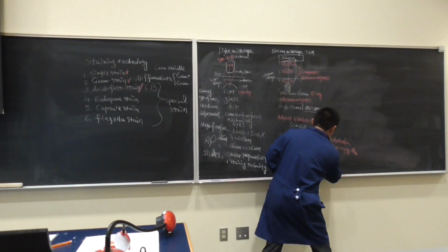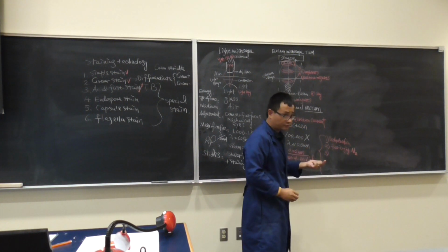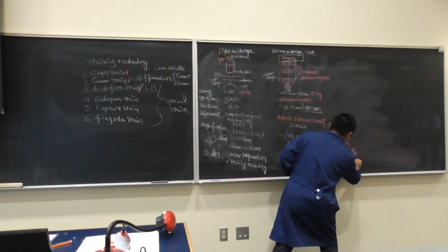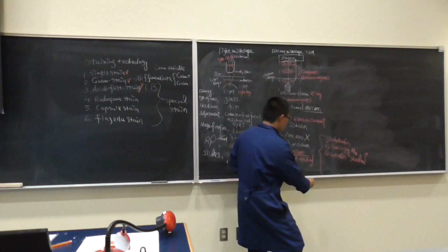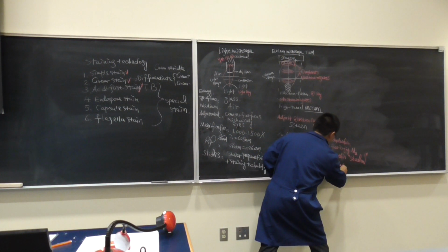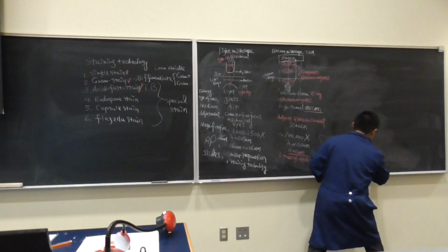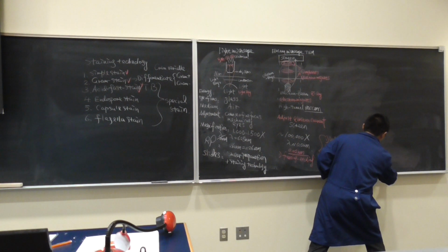When the freeze drying happens, what are we going to do? We have to slice it, we have to cut it. So cut into very thin pieces. And this moment we call it a shadow. The shadow is going to generate. And then we have to do a coating, coated with heavy metal. The heavy metal coating usually is lead or sometimes platinum.